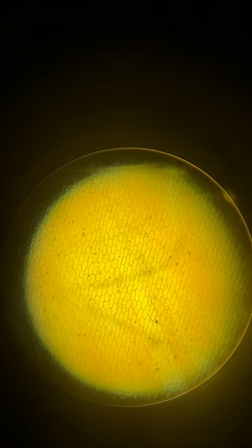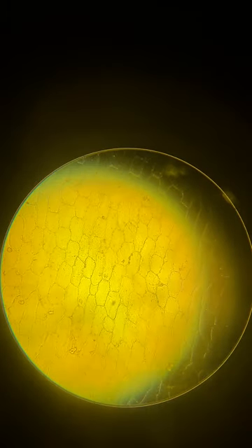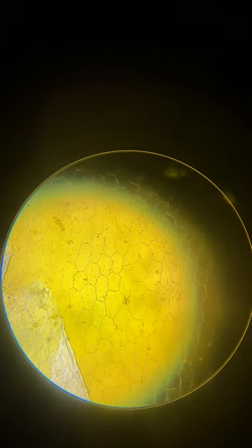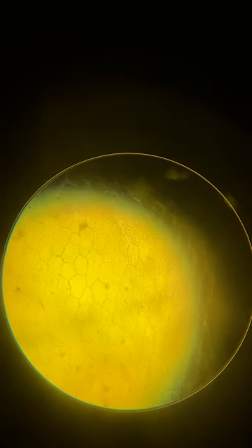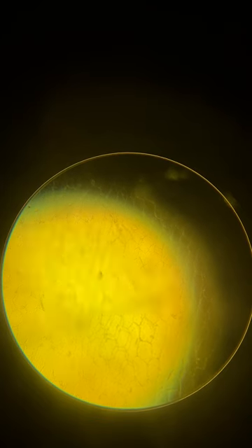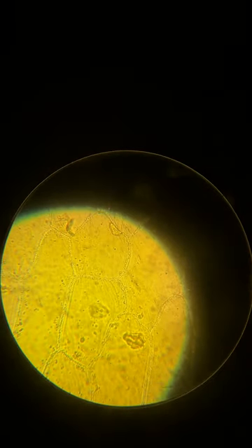There's a good one right there. Let's see if I can focus in on that middle one. Go to yellow. I touched the slide too much — I have to go back to red. There we go. That's a good nucleus right there — you can see that one kind of popping up. So this is what I want you to do: go investigate and be curious.